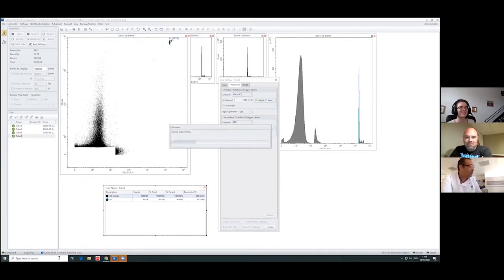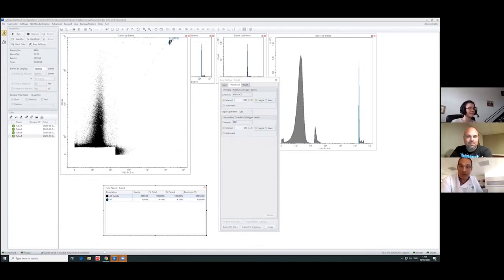Okay. So percentage-wise it is the same, but now we know how many events we have, and for statistics it is correct. The distribution hasn't changed. In fact, everything is far smoother than if we compare to the previous one, where you can see more flicky things. So we don't need to use the smoothing in the software. We can achieve it by increasing the number of events.